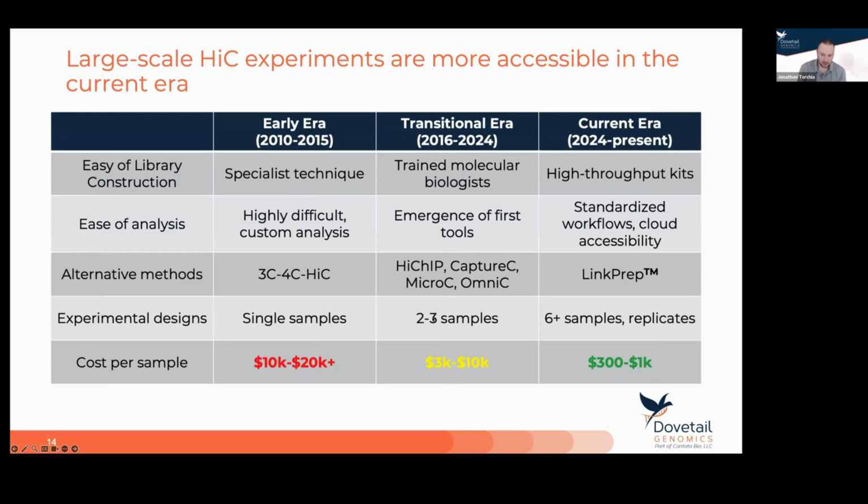But still, your experimental design is still kind of limited because the cost is still prohibitive, and the tools that were available are still kind of in their infancy. Today, I would argue that this has changed significantly.